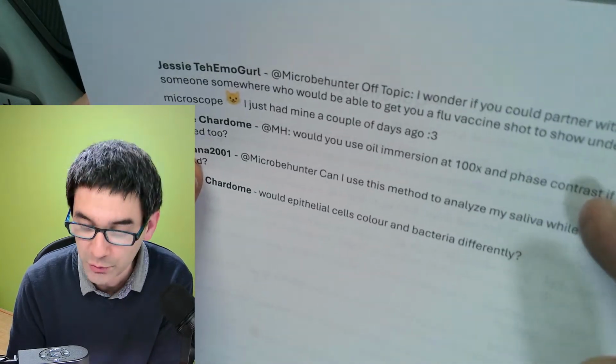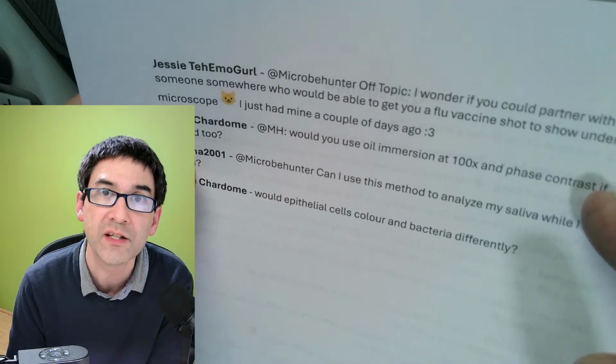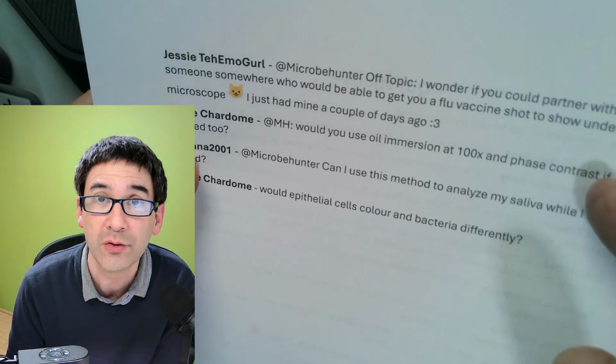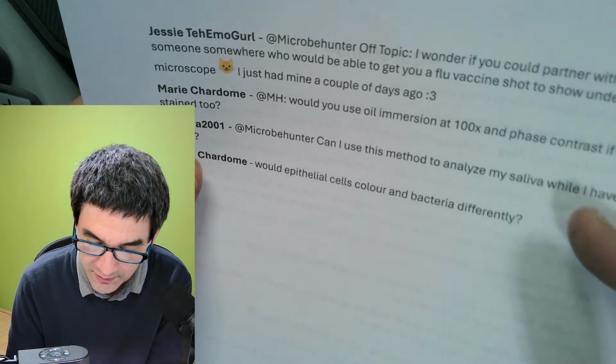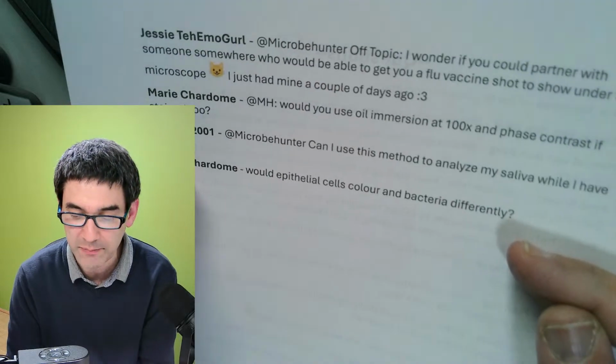You can try it out, but I would not mix it, because with phase contrast you're losing the, how do you call it, the color. Yeah. Saliva, I just did that. Yeah. Would epithelial cells color and bacteria differently?